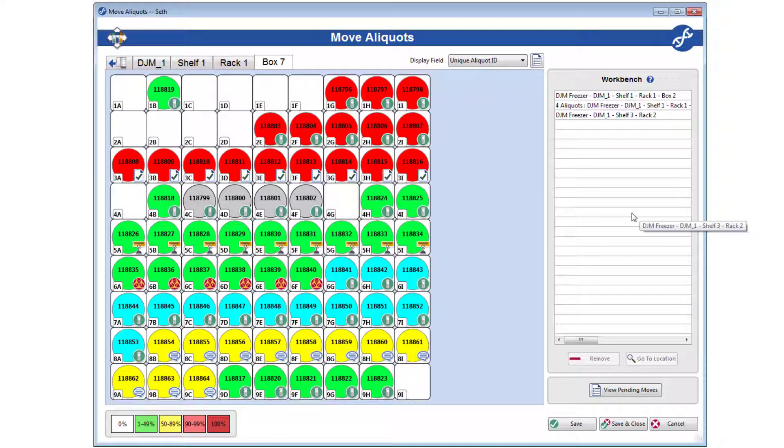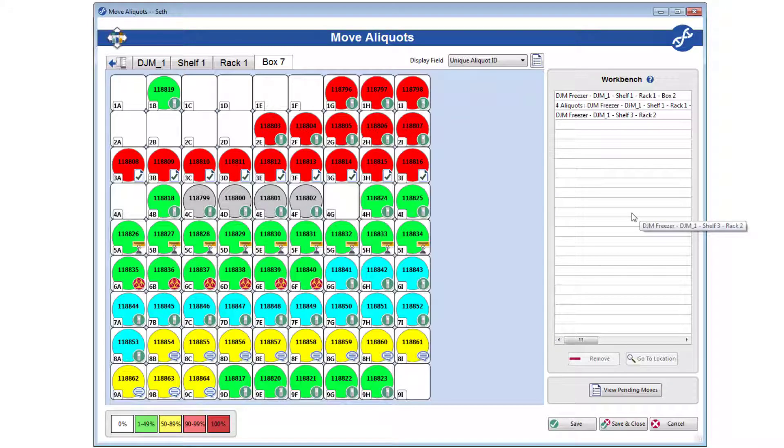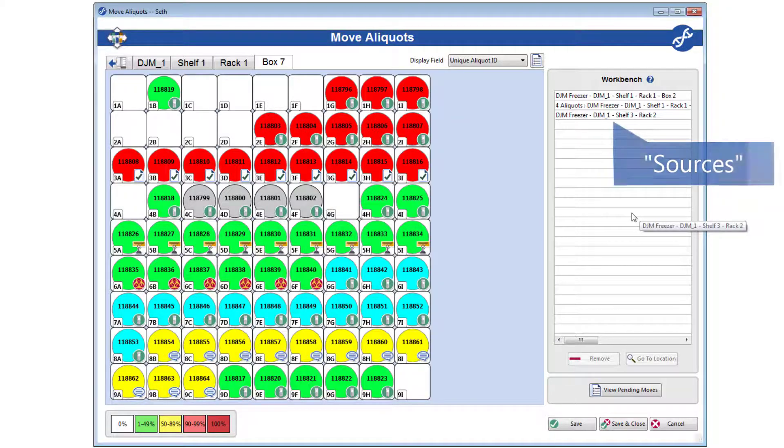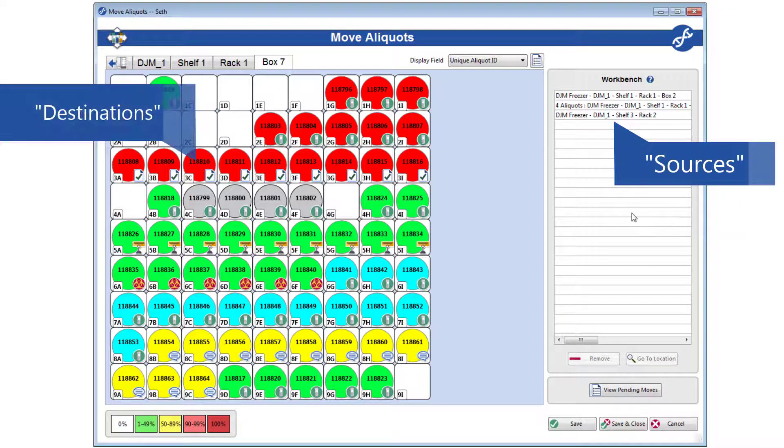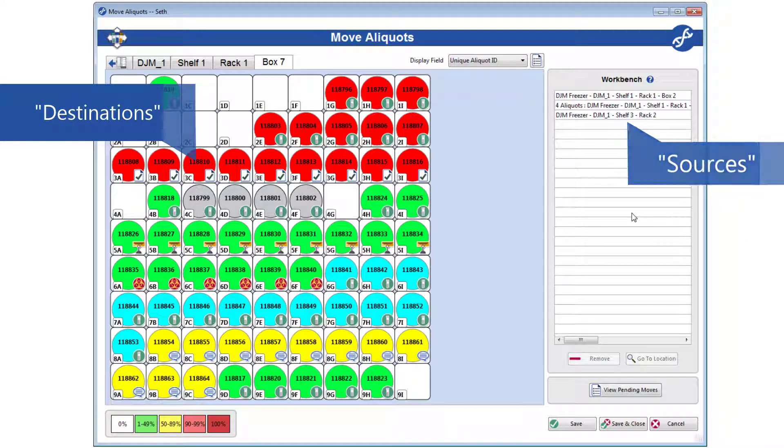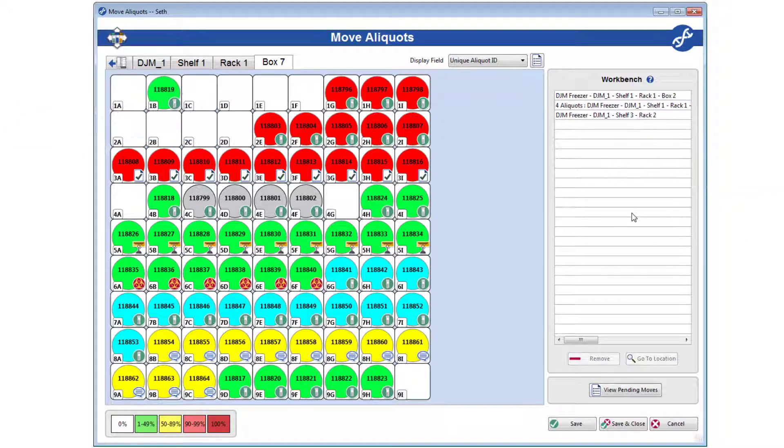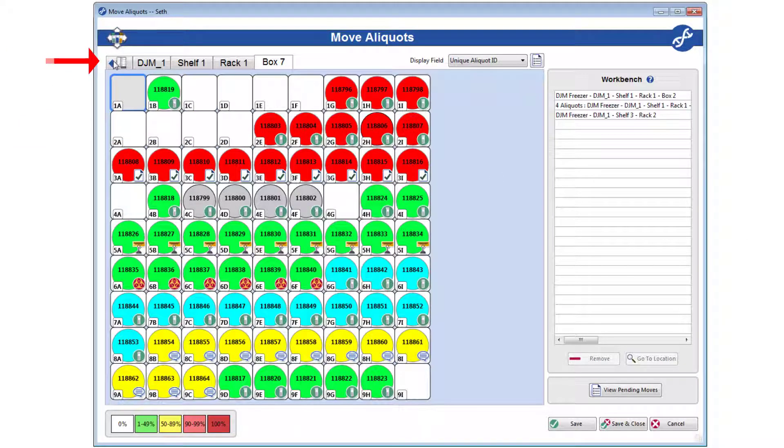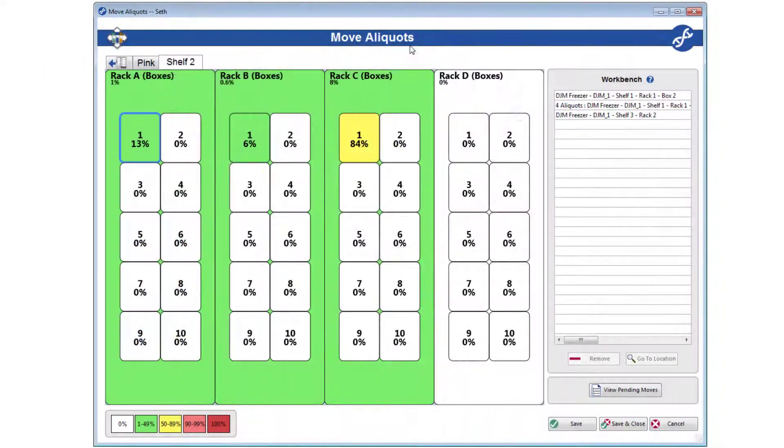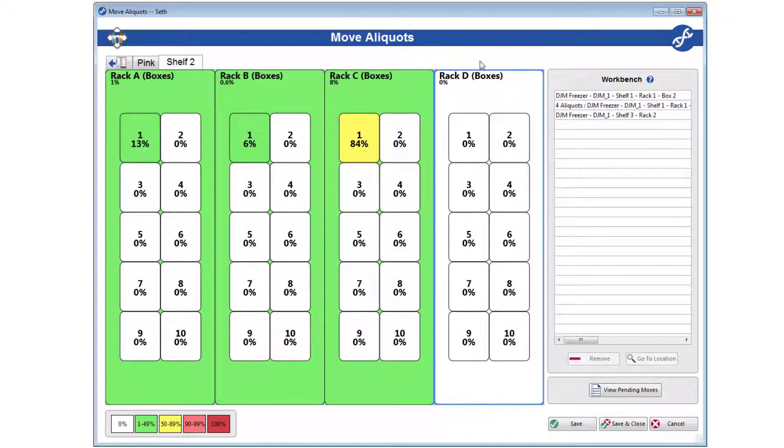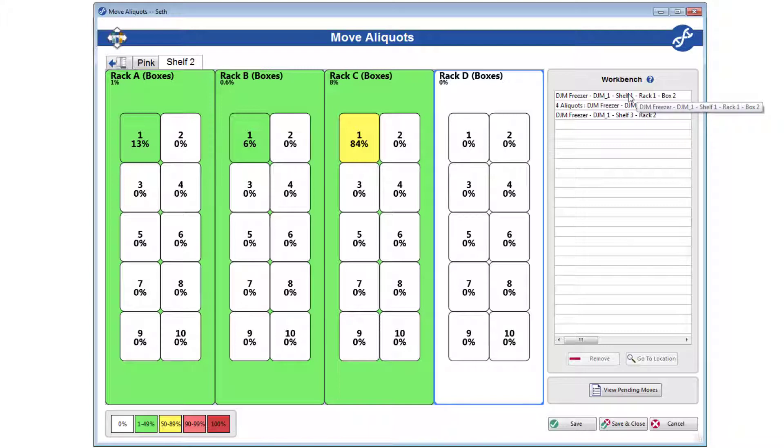Now, once you have all of the aliquots and subdivisions you want to move on the workbench, aka the sources, it's time to find their destinations. Again, if you need to change freezers, use this first tab. Once you find the location you want to move aliquots to, click and drag the source objects from the workbench to the desired destinations in the picture.